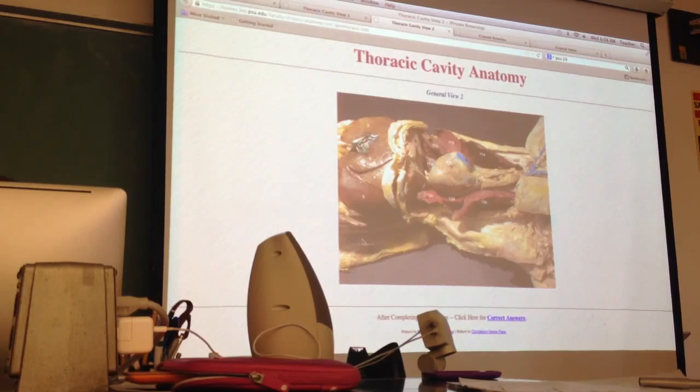All right, now the greater and lesser omentum and the mesenteries, we're going to cover more when we do the digestive system, but it's really important to note that you don't want to pull out the big fatty pouch in the abdominal cavity, okay? When you open up the abdominal cavity, you're going to see that there's this big hunk of fat. It's actually a fatty membrane, and that's the greater omentum, okay? It's an organ, so don't pull that out. Just leave everything in the abdominal cavity how it is. Okay, we're not going to be touching that.